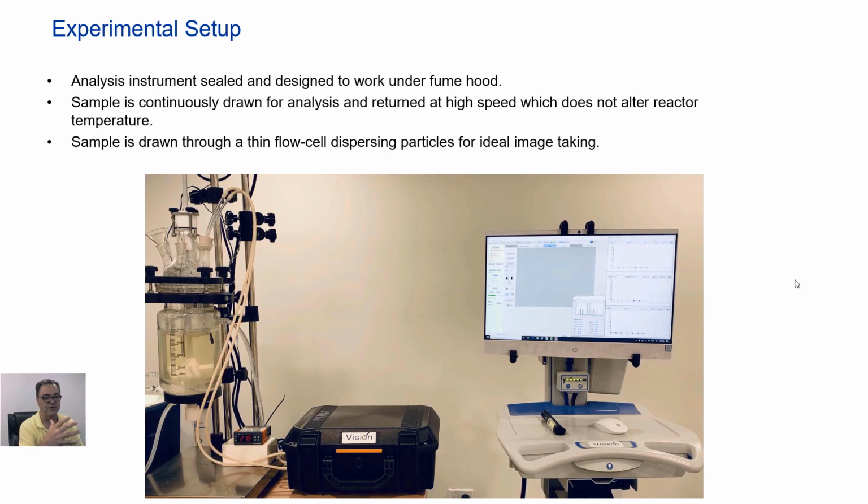And we did notice that there's really no difference in temperature by having a sample aliquot taken in and pushed right back in. So nothing is done inside the instrument to alter the sample. The sample is just drawn in, the analysis is made, and it's put right back. Okay, so that's the actual physical setup.